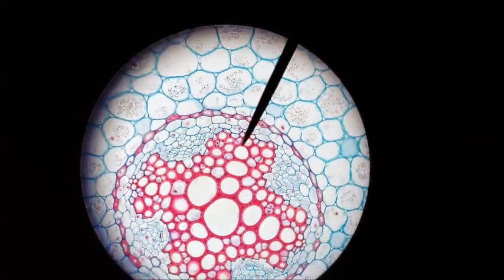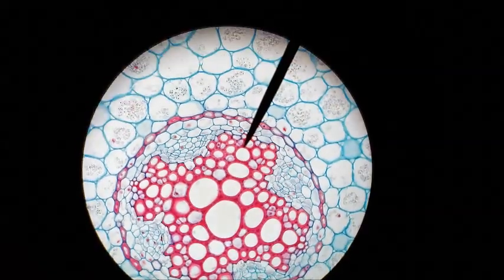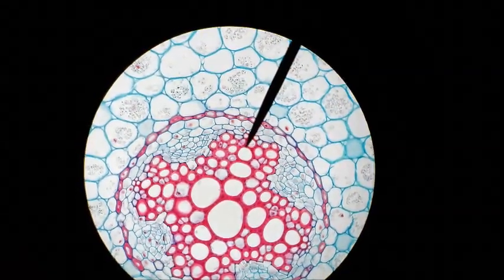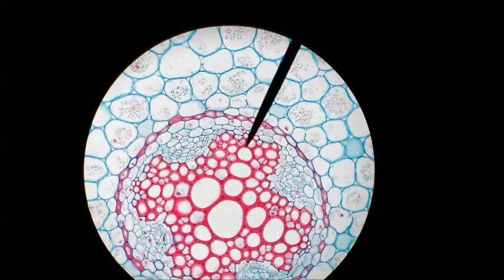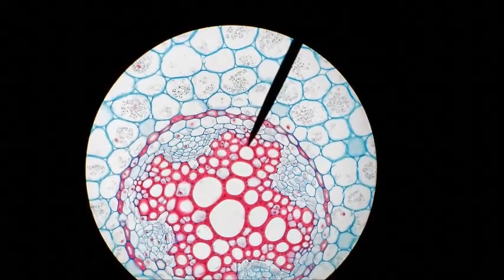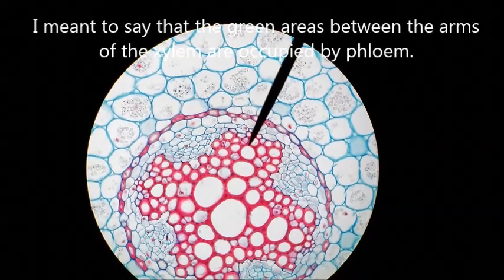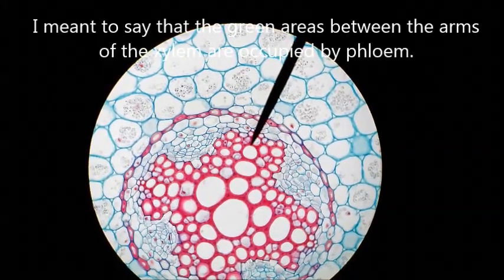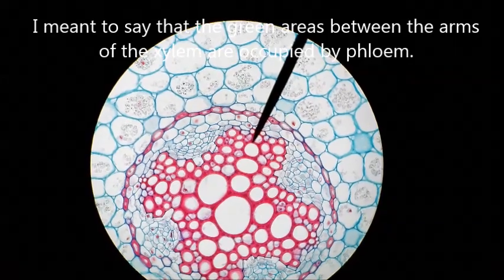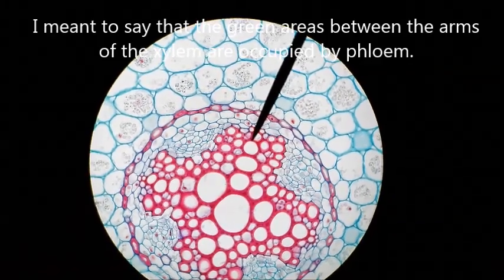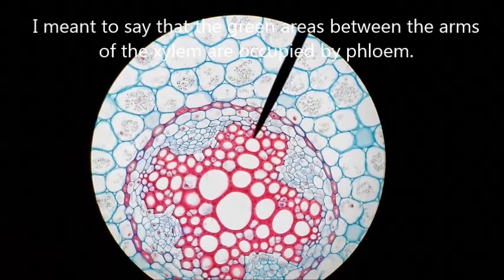In this 400x magnification of the ranunculus root which is a dicot, the pointer is on the xylem and this is sometimes called the primary xylem. The green areas between the arms are the phloem and then the circular region is the endodermis. The outer cells are called cortex.